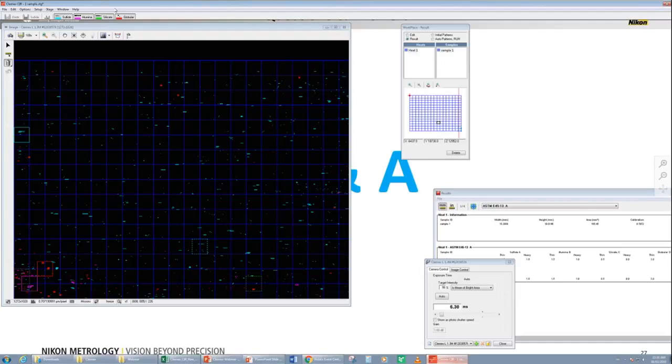Once we do the installation, we can go in the configuration file and set an option where any silicate that it may find will be classified as a sulfide. Because they're the same in shape, it's only in thresholding that they're not the same. If it finds something that's in the same shape, it will automatically classify it as a sulfide.